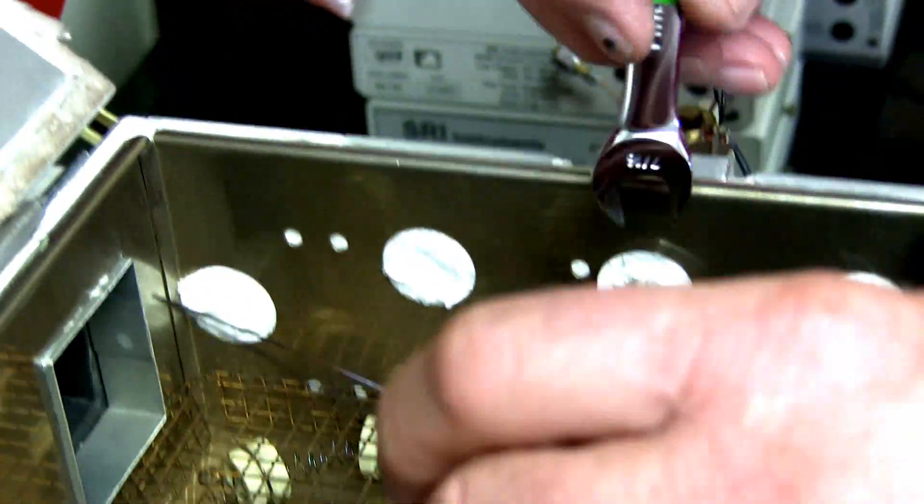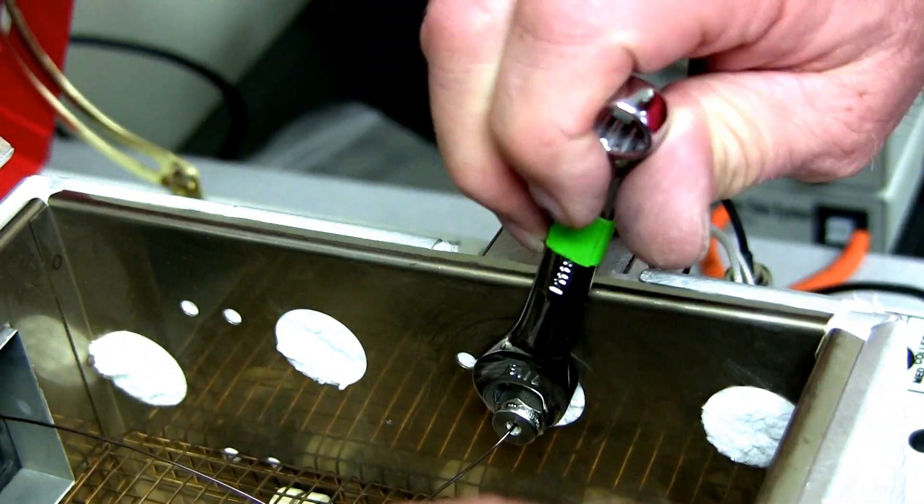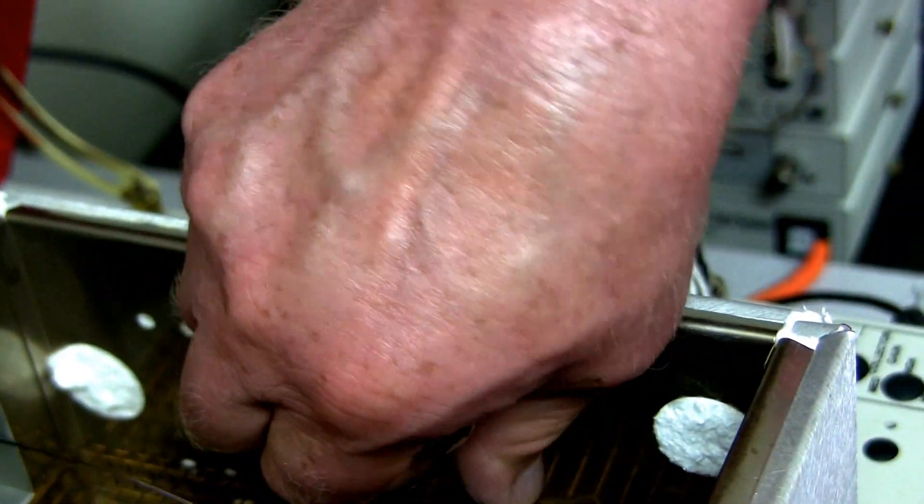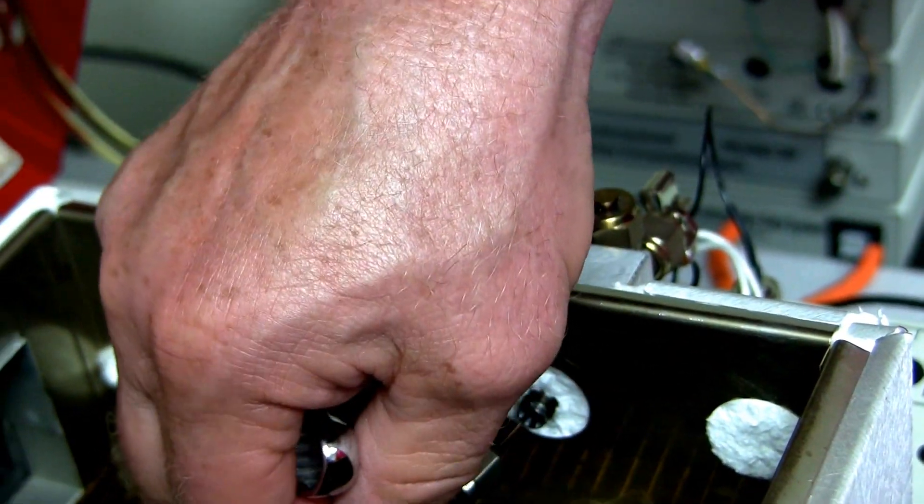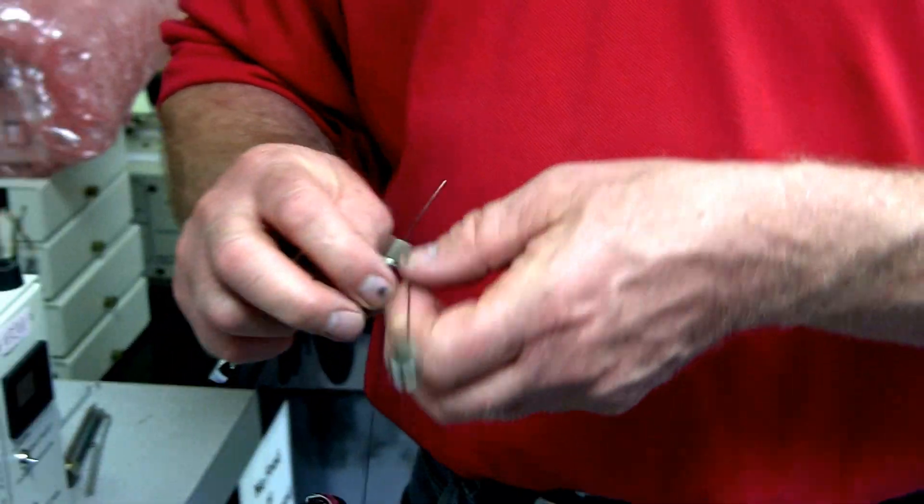Same on the detector side. Loosen the swage lock nut. Could be hot so be careful if it is. And then pull the column out and now the column is completely clear.